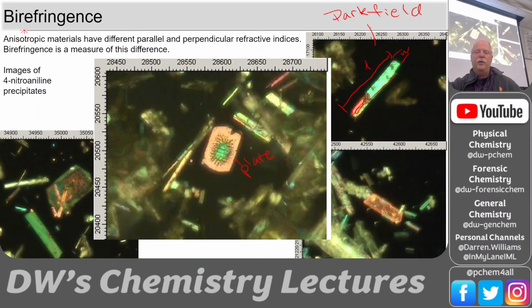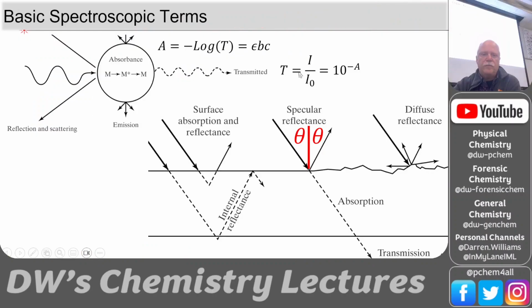And that's what we were doing. We were trying to change the different solvents to see if we could change what's called the crystal morphology, or the form of the crystals. Do we get more needles when we use this solvent? Do we get plates when we use that solvent? Do we get gravel where everything just precipitates out so fast it's all microscopic? But the point is to increase contrast. That's the goal, so we can then make measurements of the crystals.